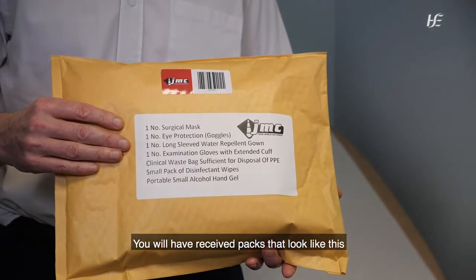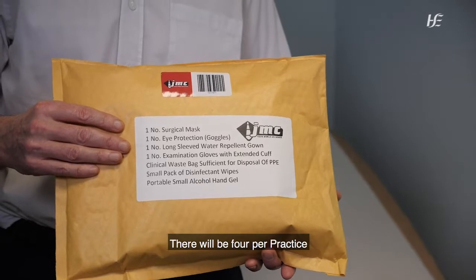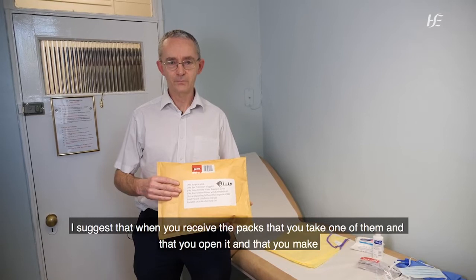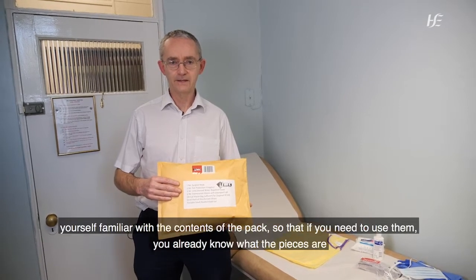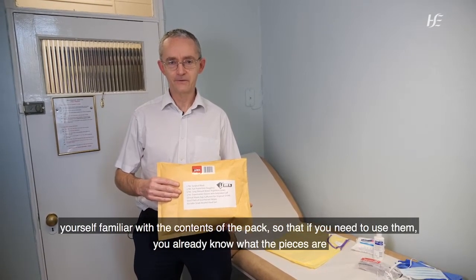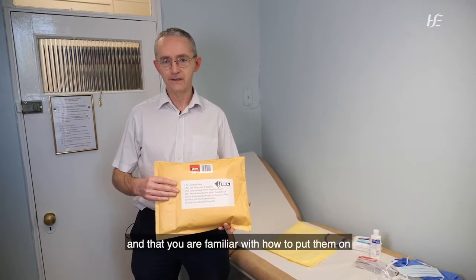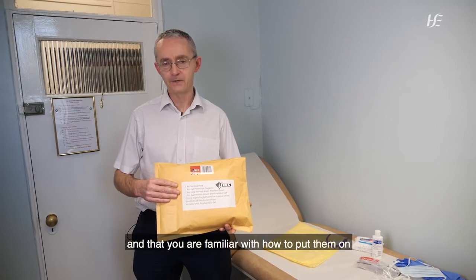So you will have received packs that look like this. There will be 4 per practice. I suggest that when you receive the packs, you take one of them and open it and make yourself familiar with the contents of the pack, so that if you need to use them, you already know what the pieces are and you are familiar with how to put them on.